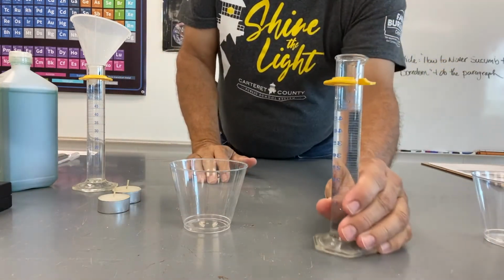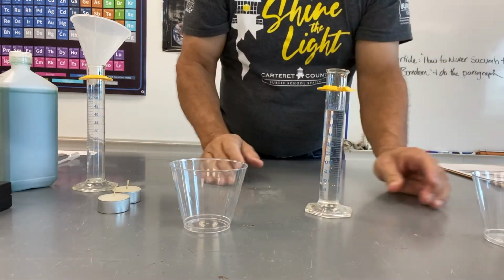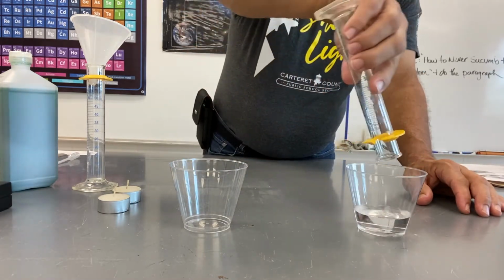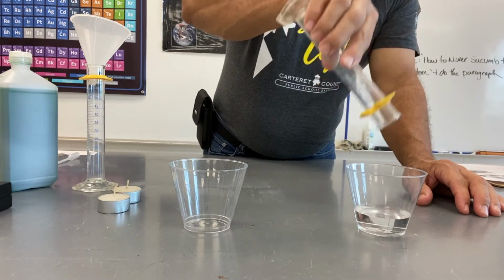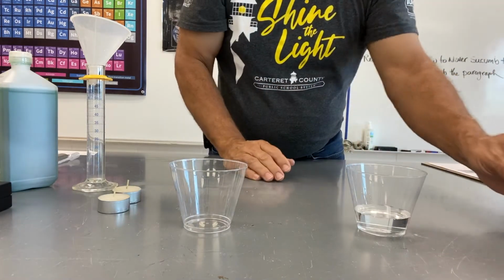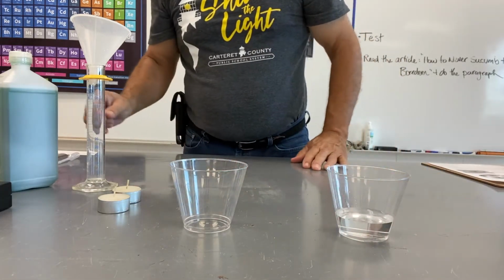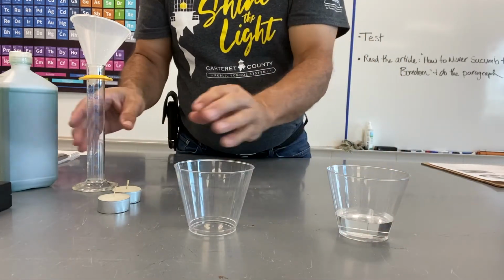All right, so this graduated cylinder is our water. I'm going to put that 50 milliliters in that cup. All right, so this side's water. On this side, we're going to use alcohol.